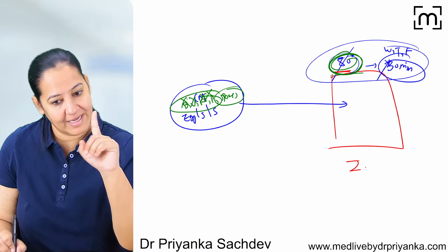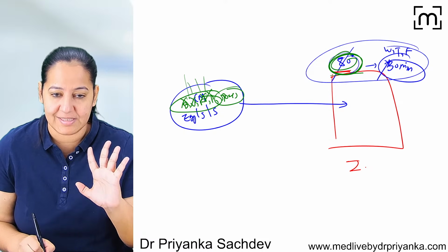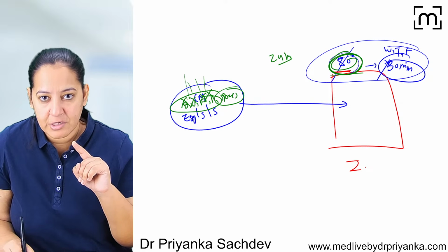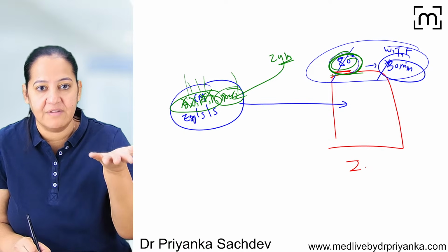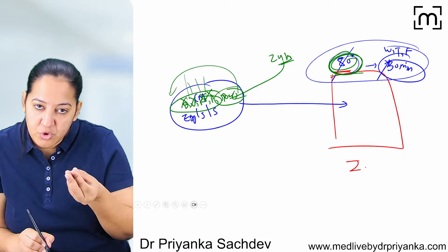Now, the first day it's over. All the bacteria, virus, fungus, parasite are killed, but spores are still surviving. Now, after that, we will give a gap of 24 hours. In the 24 hours, we will try to germinate the spores. We will give the time to germinate. Once they become germinated, they will convert into bacteria, the vegetative forms.